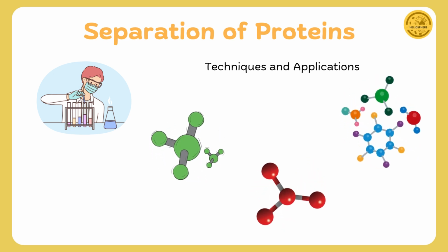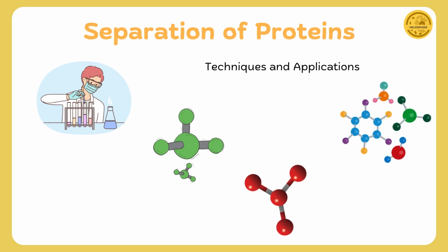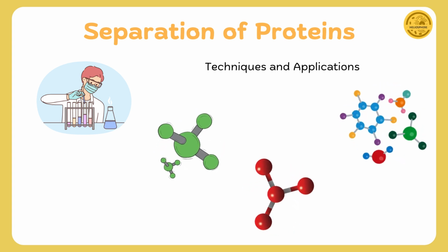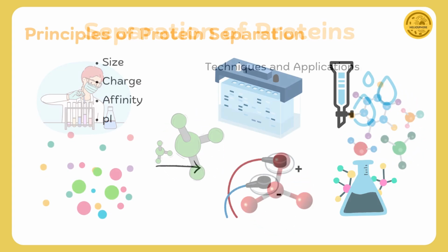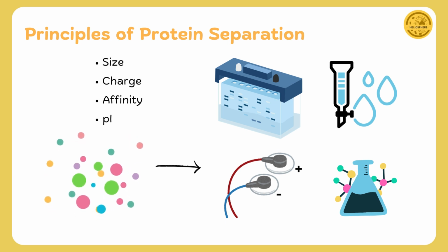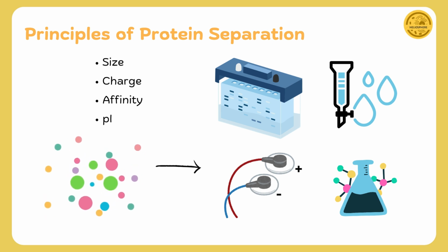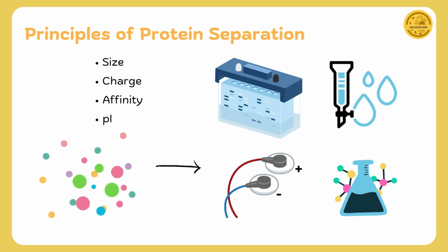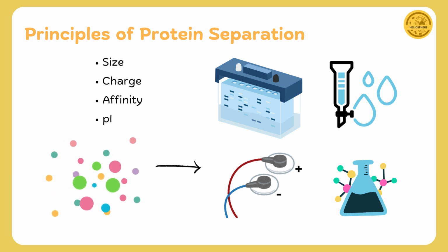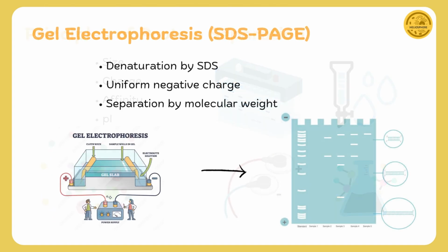We will be exploring the principles, techniques, and applications of protein separation in biochemistry and molecular biology. Proteins are like snowflakes. Each one is unique. We separate them based on their physical and chemical properties like size, charge, and affinity. Understanding this principle is crucial for selecting the appropriate separation technique.